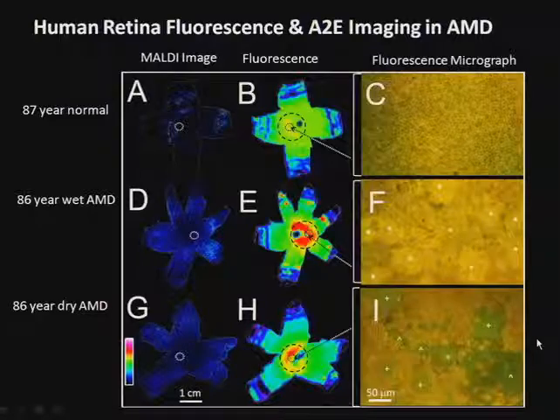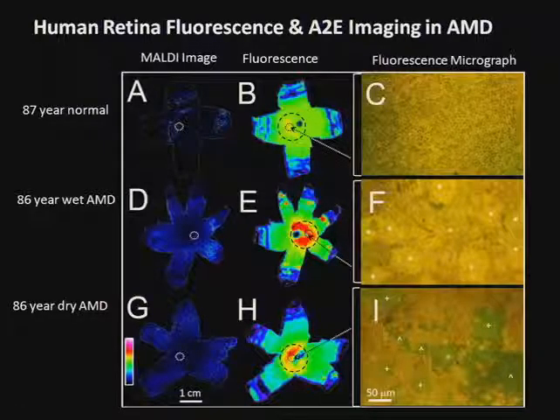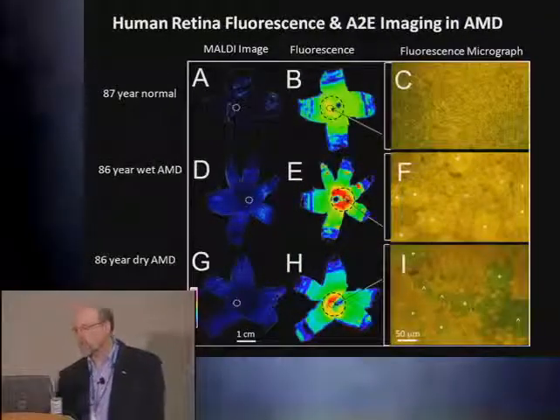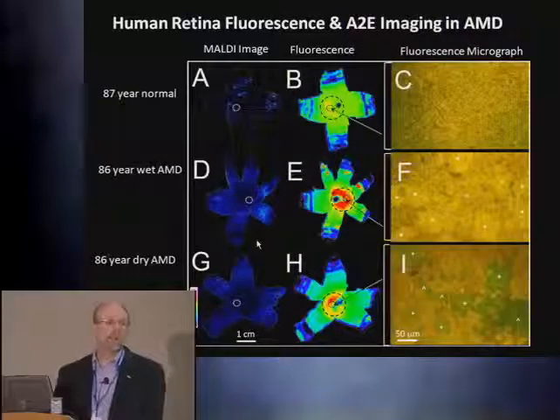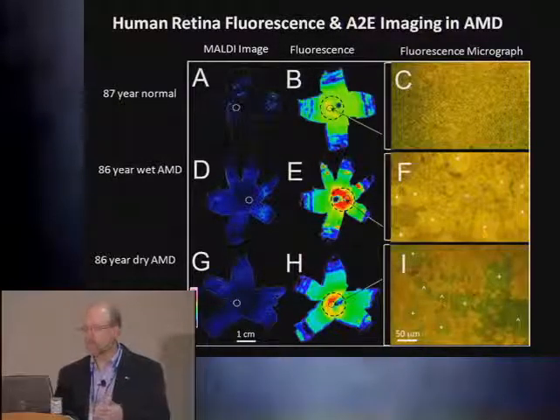So our conclusion is that the A2E molecule itself is not involved in the etiology of AMD. Now, it could be that other retinoid metabolites are involved. So our next step is to figure out what molecules are accumulating in the disease region using whatever sources we have available to us, imaging, of course, but even LCMS to try to dissect out what's happening in the macular region.